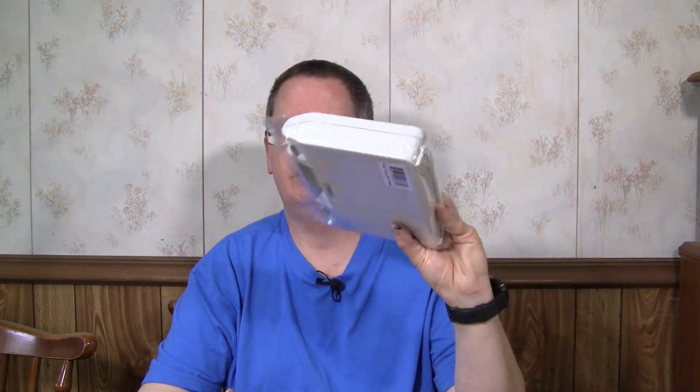So I was looking at the APRA pH tester and they had a lot of good reviews on Amazon. This is basically their equivalent disposable pocket tester — it's much cheaper. For about what I paid for this you can get a version of the APRA tester that has replaceable probes. I started to get that but looking at the extra cost and the cost of the probes, I could probably go through two to three of these for the same price. So I just wanted to see how long this one lasts — if I get a couple years out of it, that's fine, it's more than I got out of the Blue Labs pen.